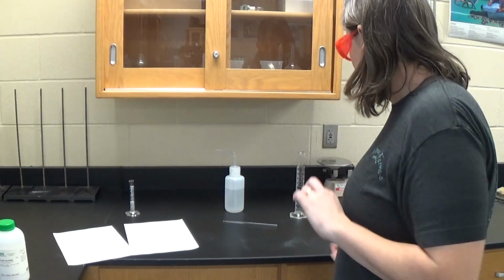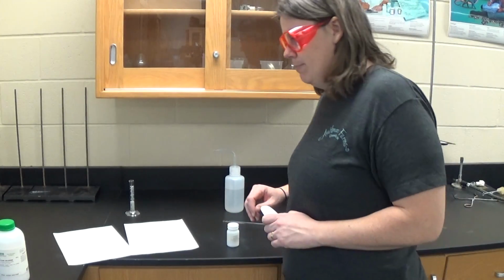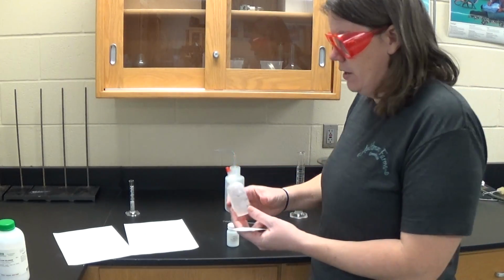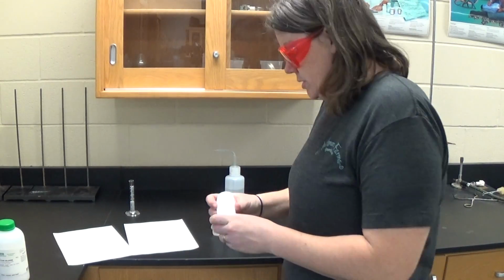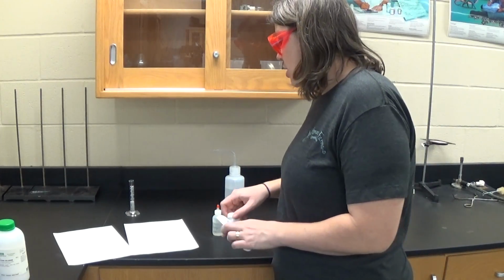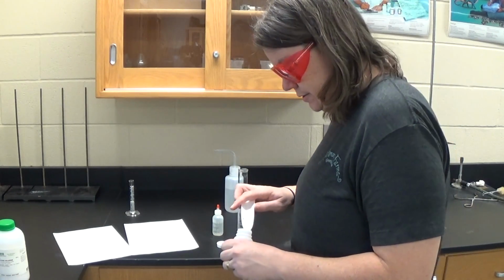And then for part B, it says that we are going to be addressing chemical changes. And for that, we'll need some sodium bicarbonate, which is the scientific name for baking soda. And we're also going to use a little bit of white vinegar. I'm also going to put this stirring rod over here so we don't reuse it. So let's go ahead and start that one. And again, it says to place 2 small scoops of baking soda in a clean cylinder. So I have that cylinder there.